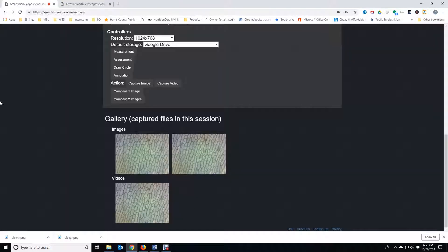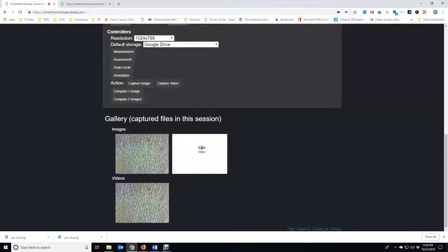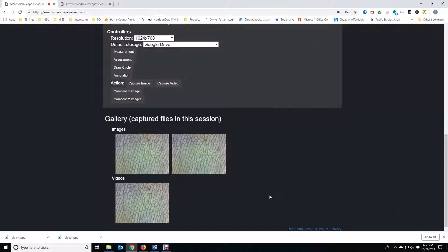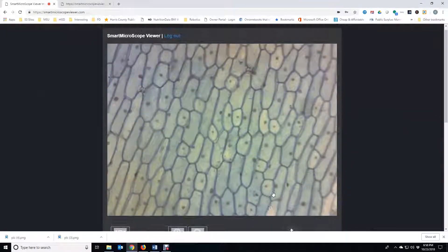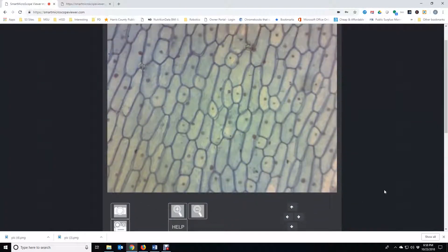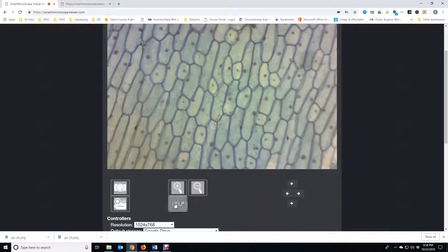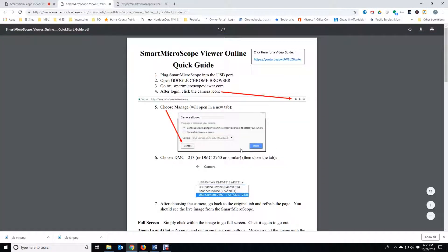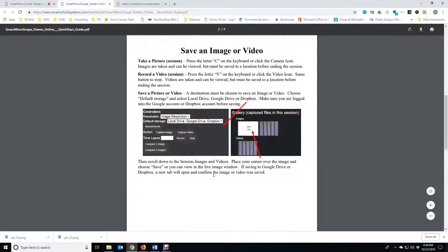Each time you save an image to Google Drive, a tab opens to confirm the image was saved. Click the Help button to easily access the Quick Start Guide. There is a link at the top for a Quick Start video as well.